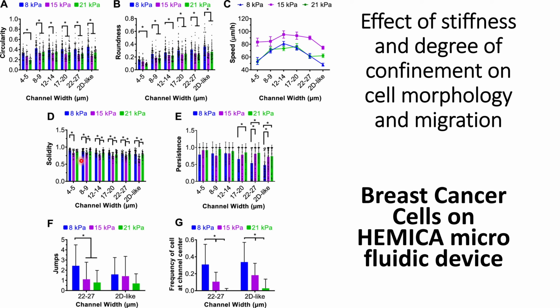So this indicates that at 15 kilopascal, because of the high speed, there is a change in the shape or morphology of the cells.